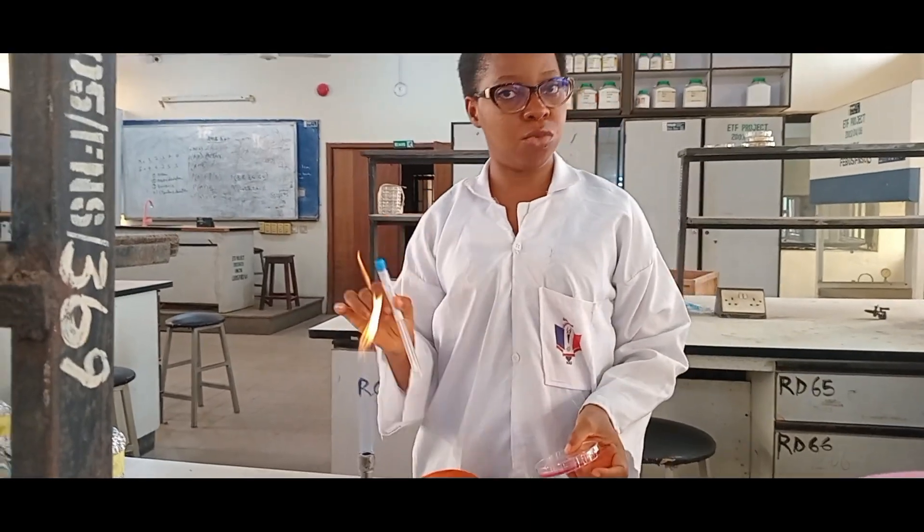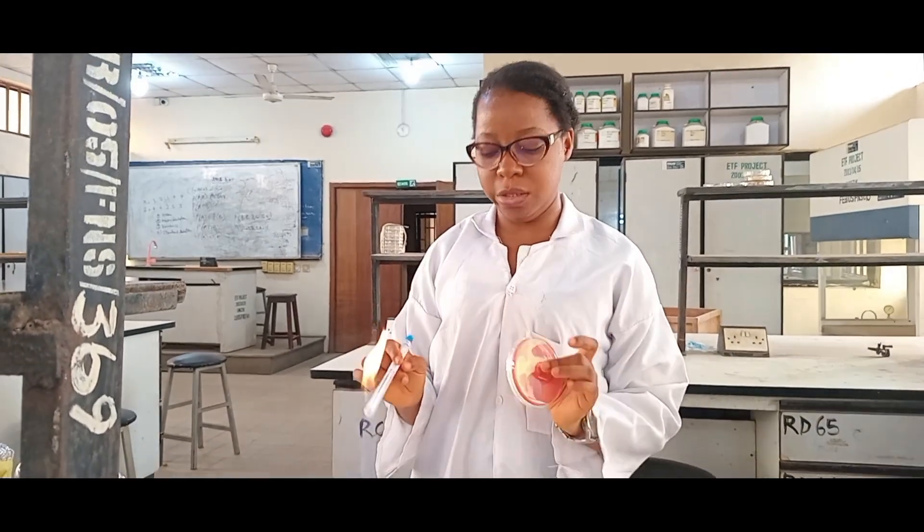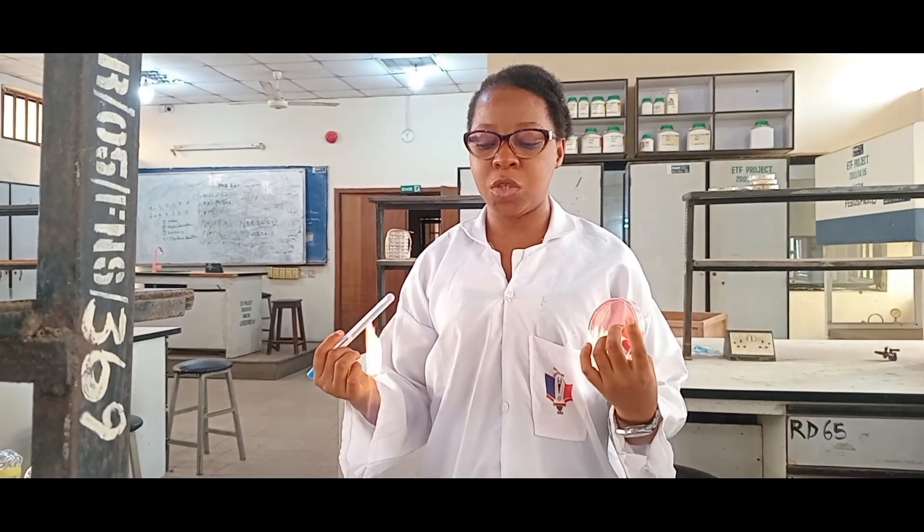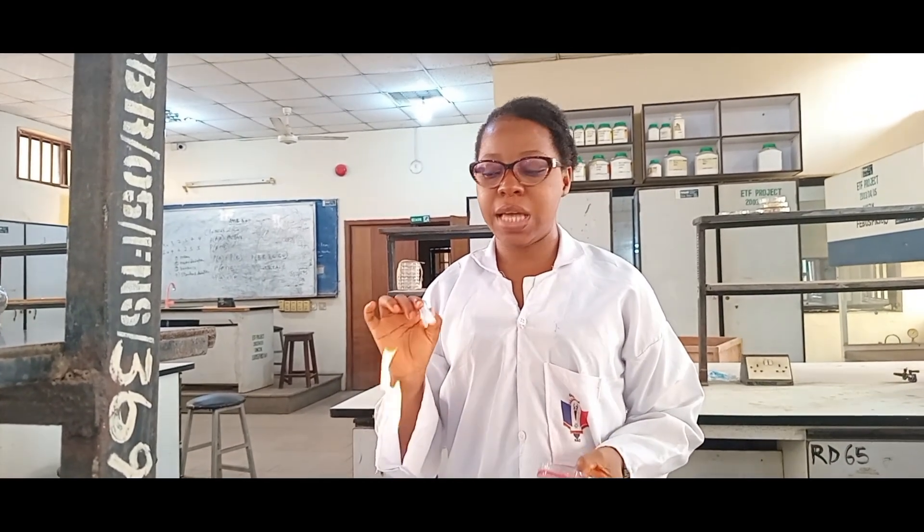Now I want to culture with the swab stick on the plates. First off, once I start I will be quiet to reduce the microbiome — there'll be microorganisms coming out from my mouth and I don't want them in the plate. So once I start I'll be quiet.